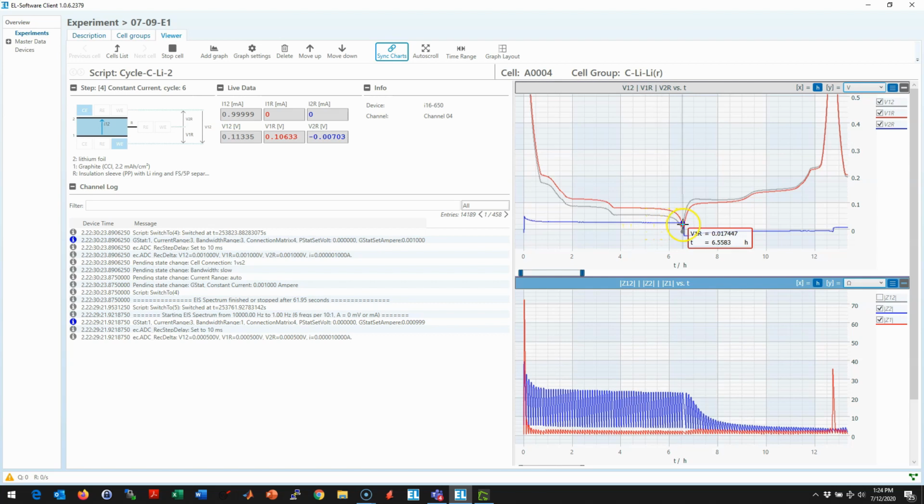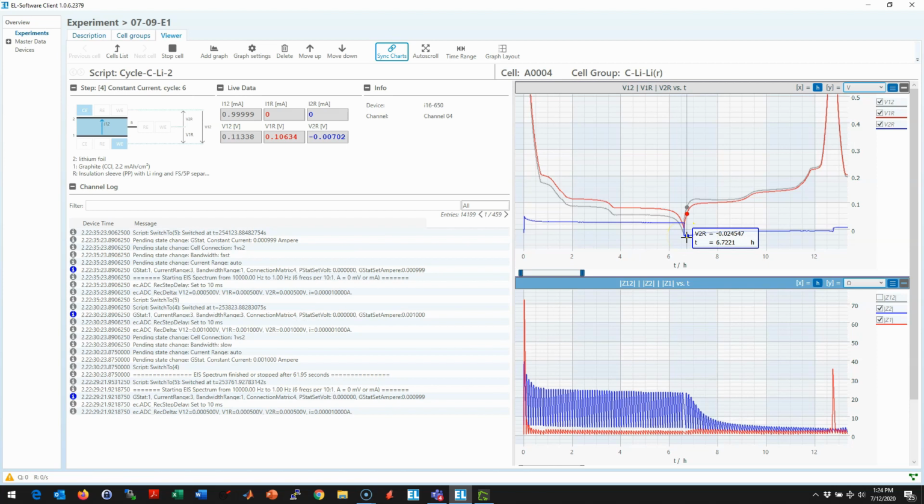And then here at the turning point where we change the sign of the current, initially still the overvoltage is high with different sign of course, but then is dropping. Look at the blue curve here. So from almost 30 millivolts down to 5 millivolts or so. And the same thing is reflected here in the blue curve.